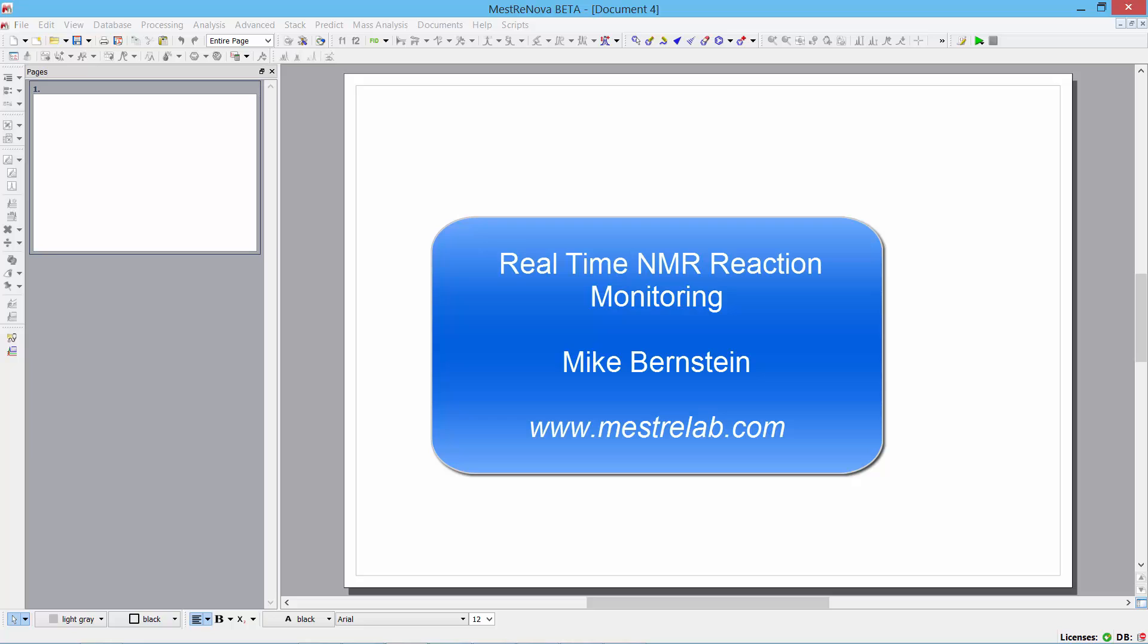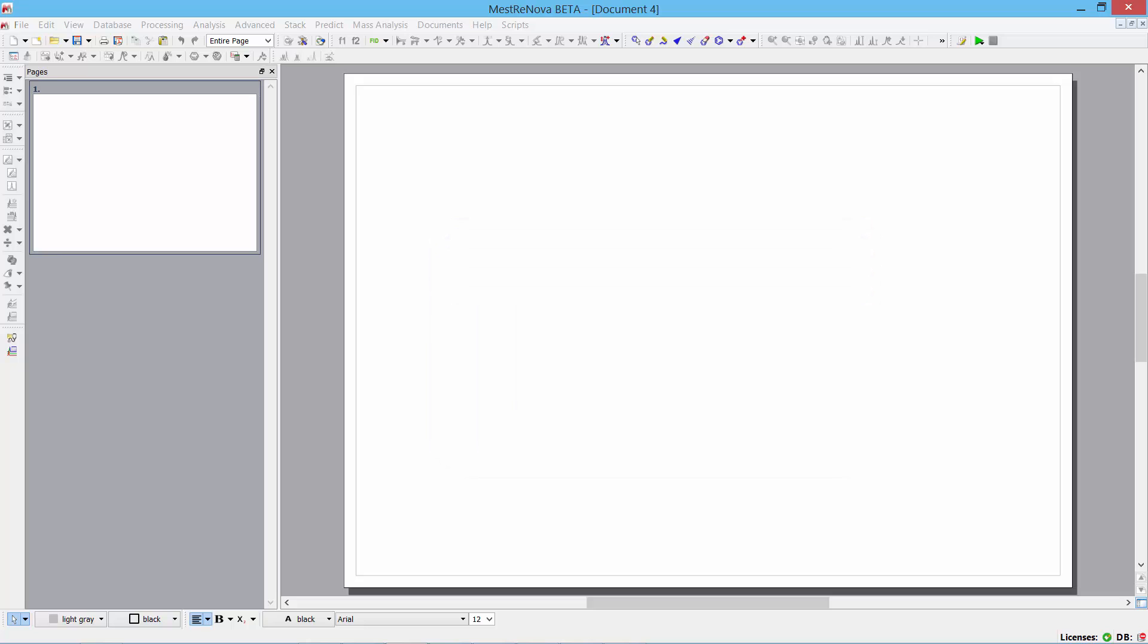And what I'd like to do today is to show you how you can use MNOVA to follow your reactions in real time and use the software to actually do things for you when conditions are met. We call this the listener.